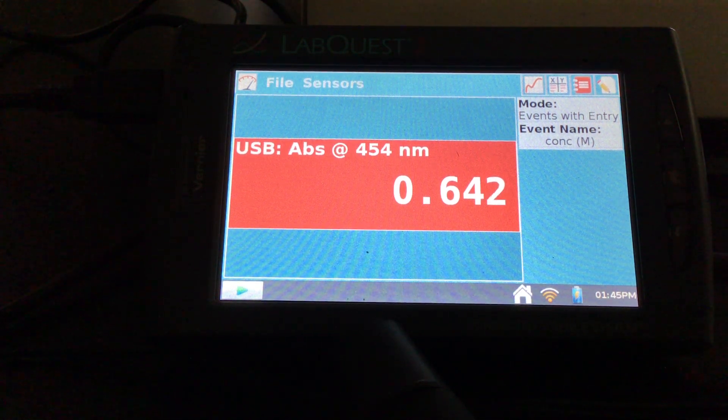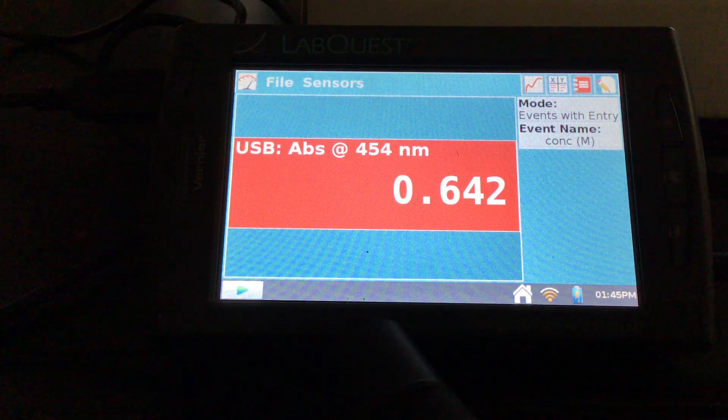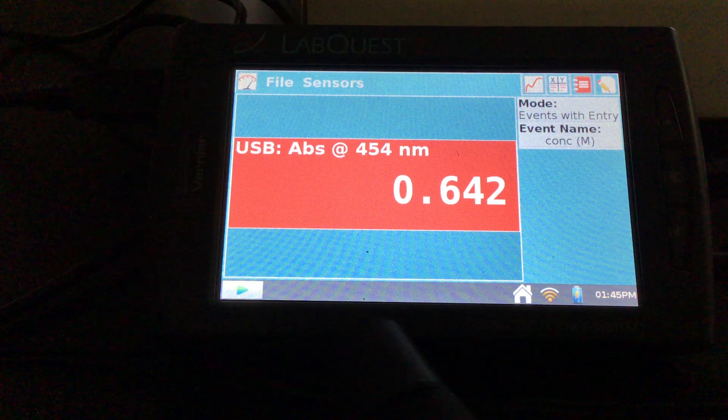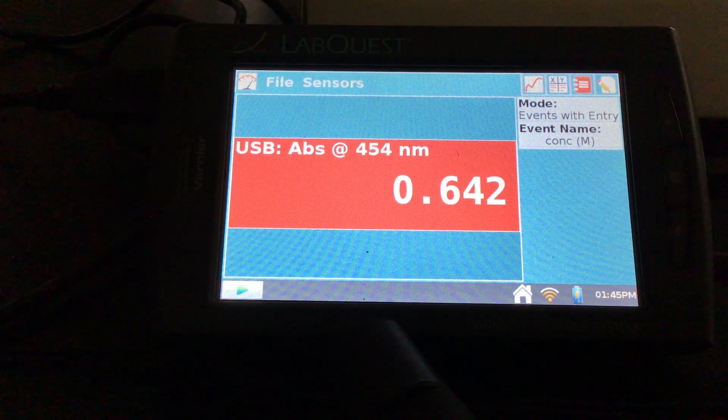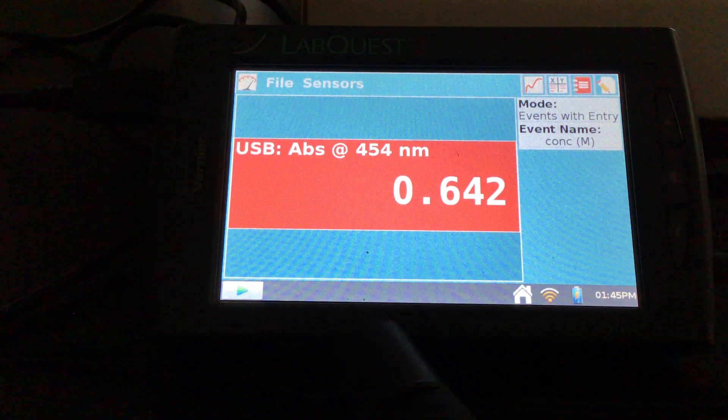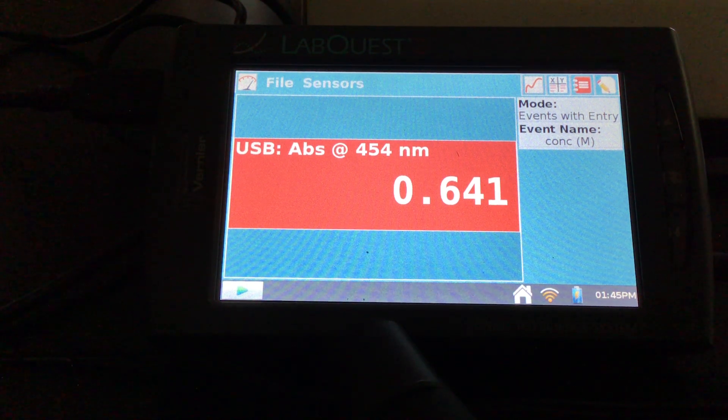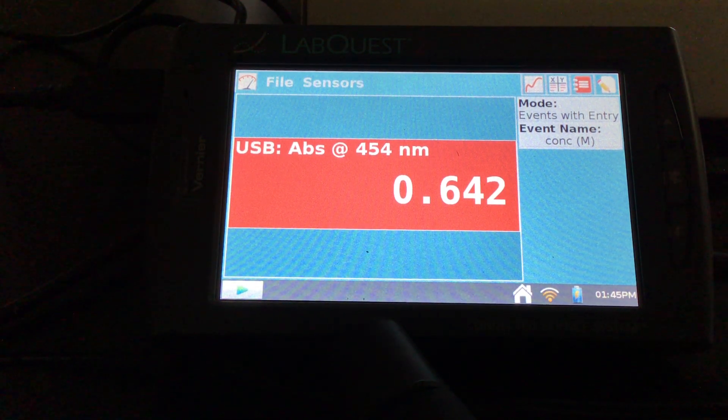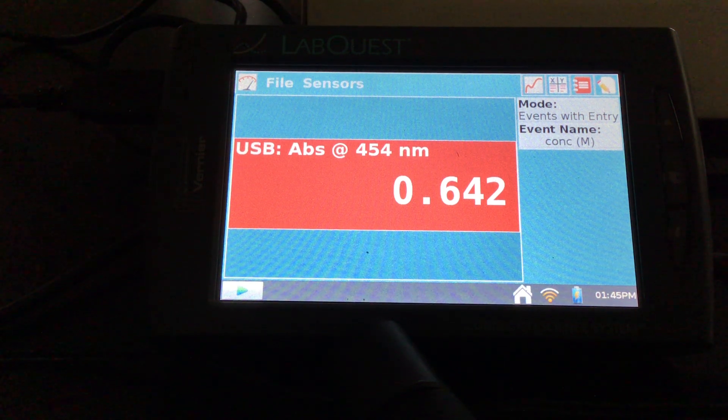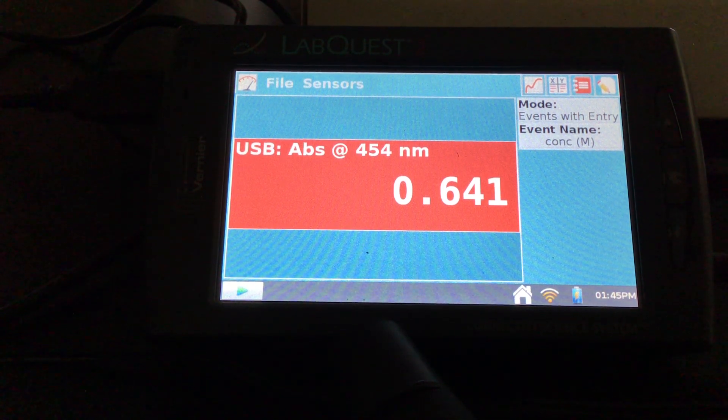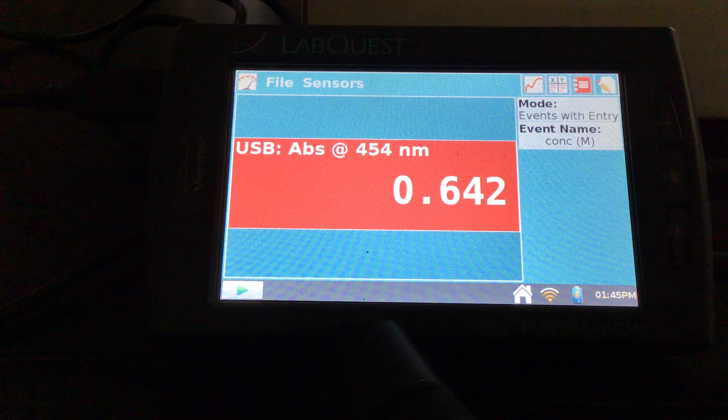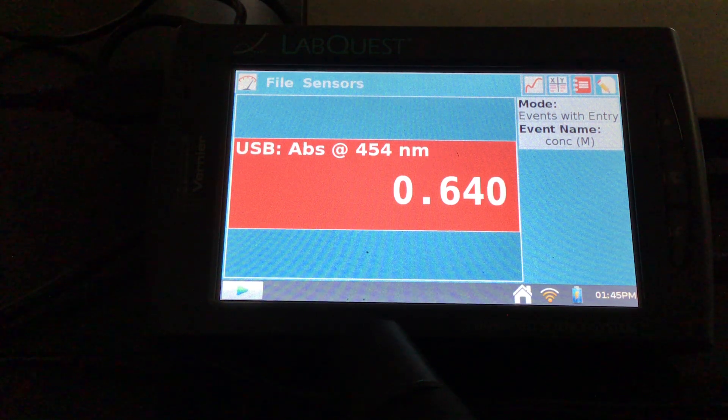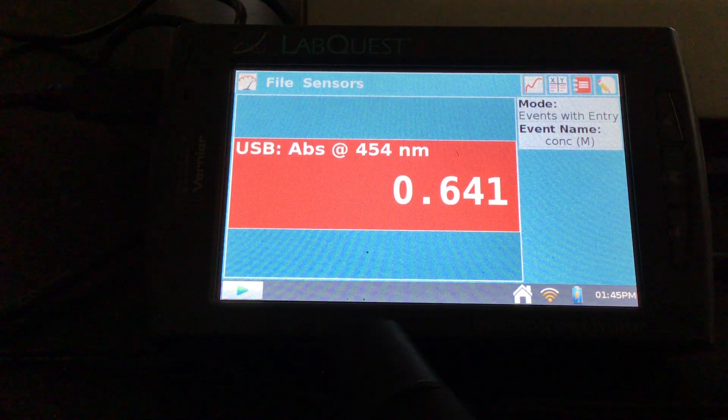So that's kind of what we have going on. So I'm going to start collecting my data. And then what I need to do is enter the concentrations of all my solutions. So for my five solutions, and I'm going to start at the most concentrated one I have since it's already in the SpectraViz, the most concentrated solution. I took five milliliters, I took actually for all of these, I took five milliliters of the 0.2 molar iron nitrate solution in nitric acid.